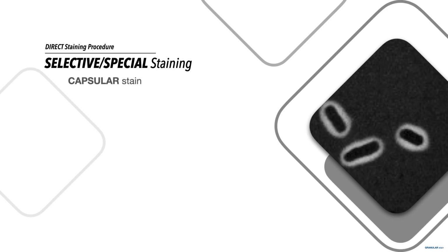Now, we move on to the second structure, and that is your capsule. You remember your capsule, guys? This is the structure that is a protective outer covering of the bacteria that protects it from phagocytosis, the immune system defense mechanism. Fun fact, the presence of the capsule increases the pathogenicity of the bacteria. It can wreak more havoc because it is more defensive, since it has a capsule around it.